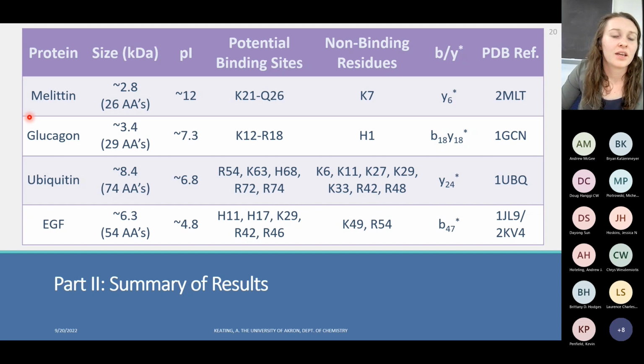And then it would be interesting to see if the monomer is weaker. Yeah, so if that second interaction actually is what strengthens that electrostatic interaction to survive the collision. So it would be worth looking into for sure. Yeah, I was wondering in terms of maybe being able to count the number of residues by the number of adducts with a simple small molecule type. I don't know if there's any need for that or advantage to that.